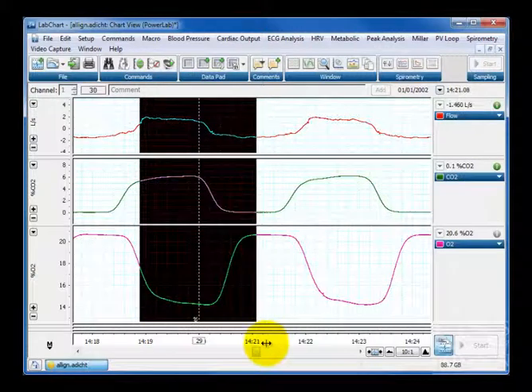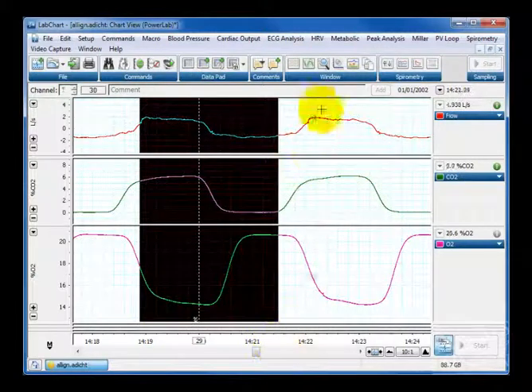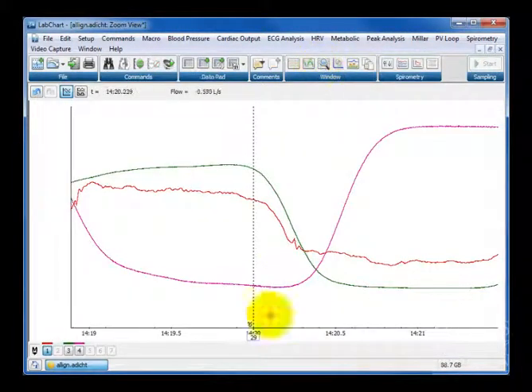So now if I select this area of data and I zoom in with the zoom window, we've now got this point ET, and using the little marker tool that we've used for other measurements, I can then work out what the difference is between this point ET, which I'm happy about being the end tidal, to the similar point on the O2.